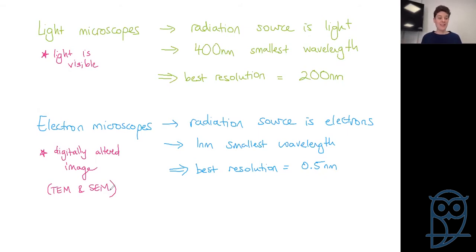But you've got a whole split, of course, between your light and your electron microscopes. So we've covered this idea quite thoroughly now, that when it comes to the major difference between them, it's all about resolution and the resolving power of the microscopes. How fine can you go? How much detail can you see? So there are quite a lot of other differences between light and electron microscopes. So let's have a look at some light versus electron microscope concepts, problems, issues, delights. Why do we even use a light microscope?